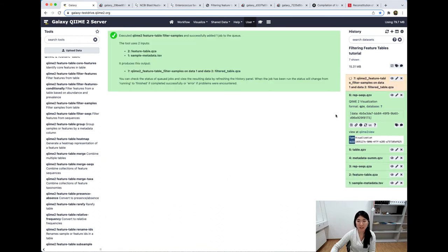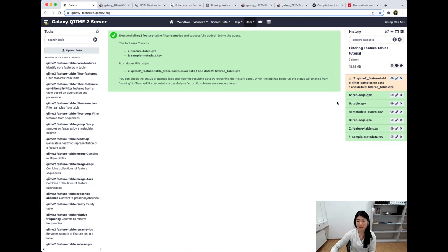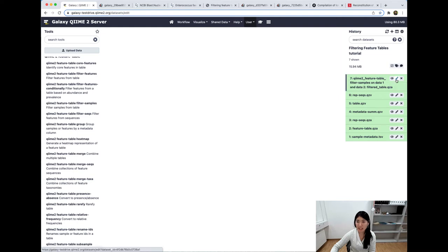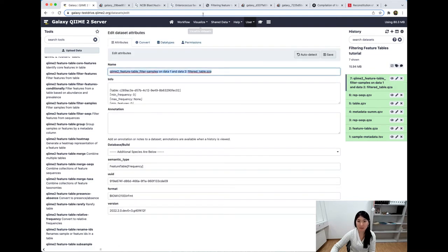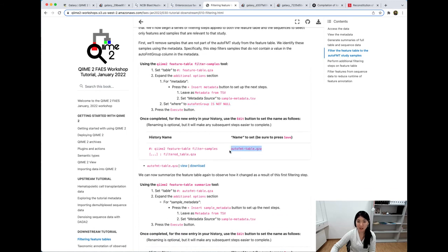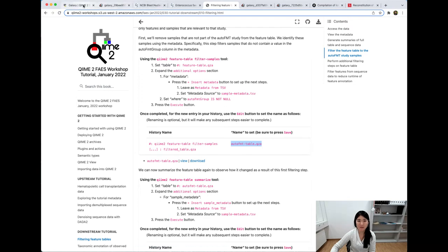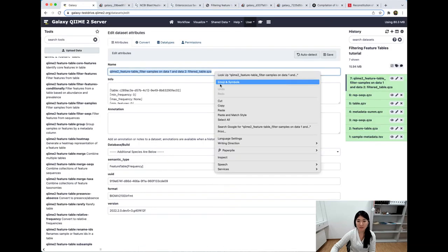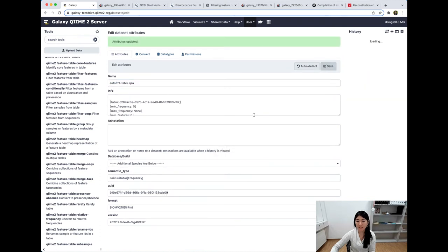Let's go back, paste, and execute. We'll want to edit the attributes once it finishes — we don't want this terribly long name. We want to call this auto-FMT-table.qza. Let's save that.